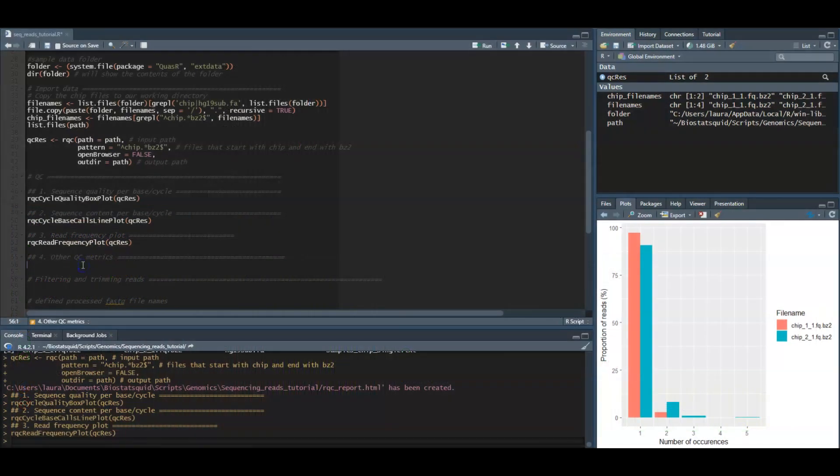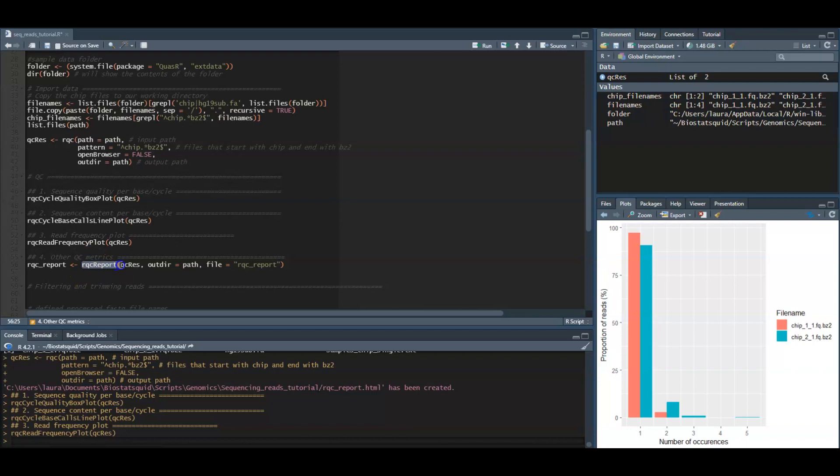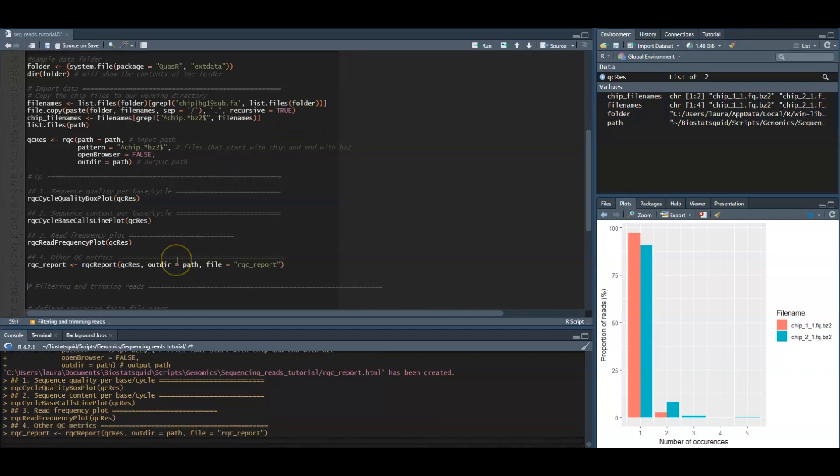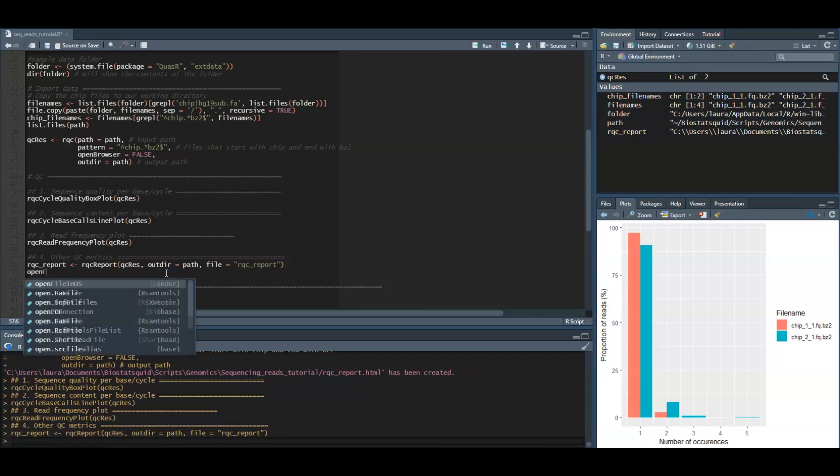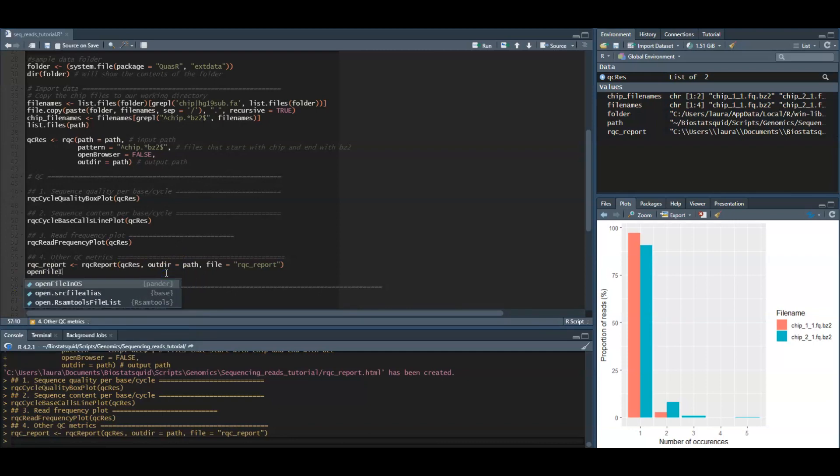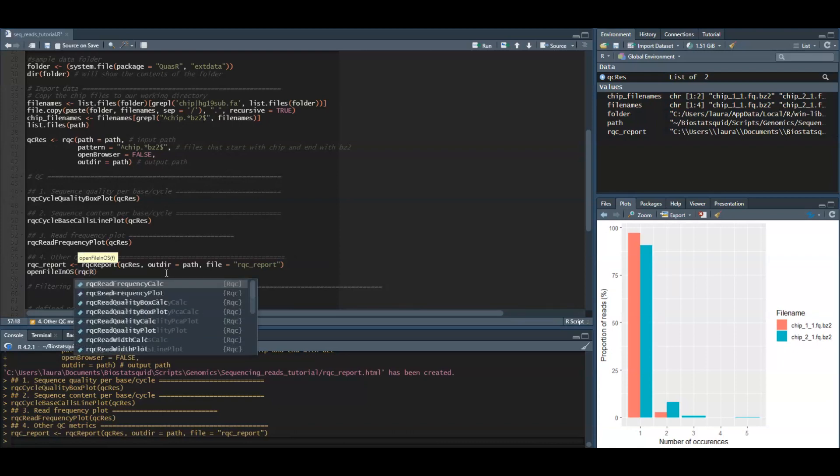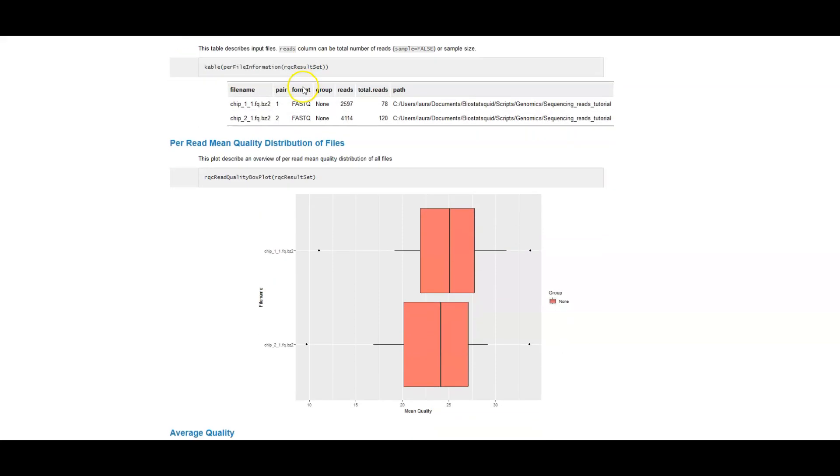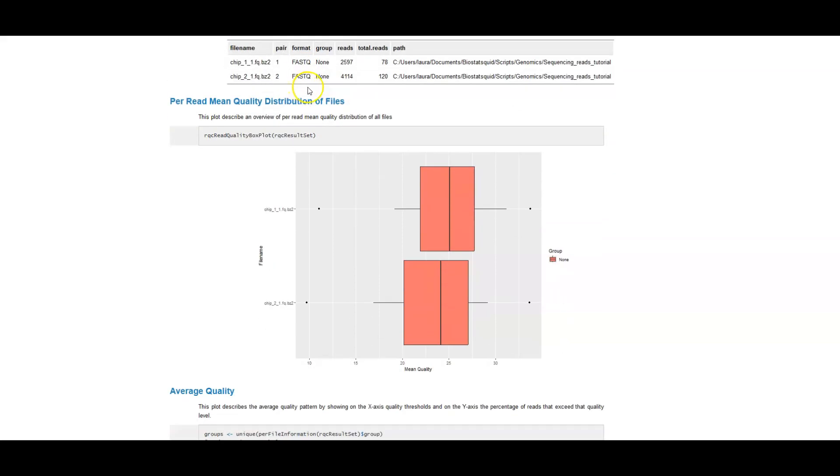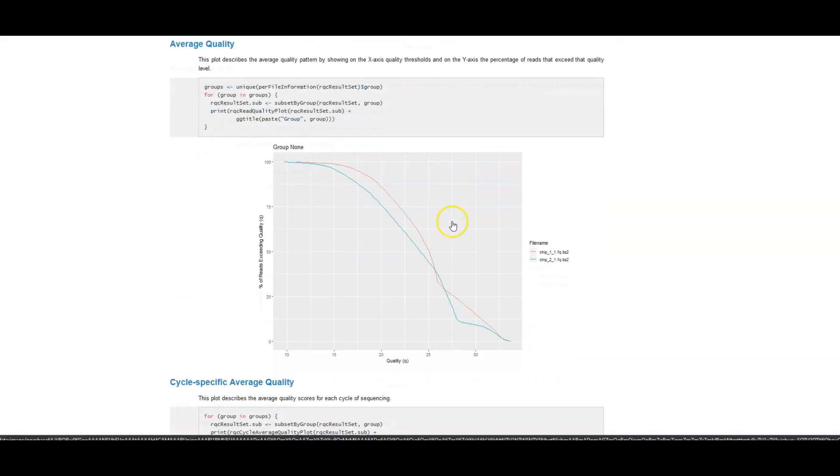The RQC package also offers the option of creating a quality control report with more quality control checks. Let's just run this and assign it to the RQC report object. Of course you can just go to the folder and click to open it, but I will open it using the open file in operating system function, which opens our report. Here you will see more quality control plots that might help you detect issues in your reads.